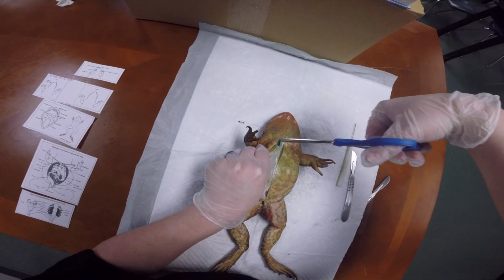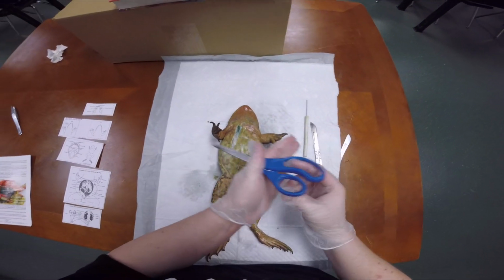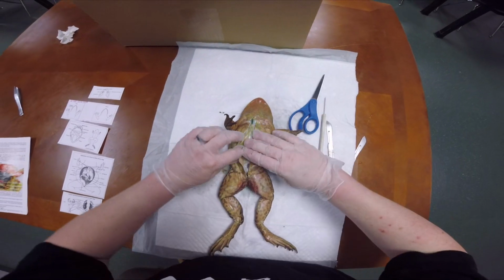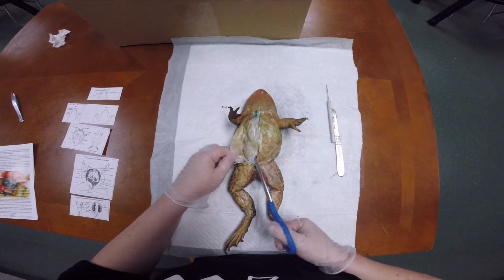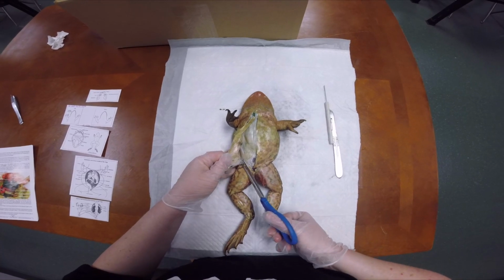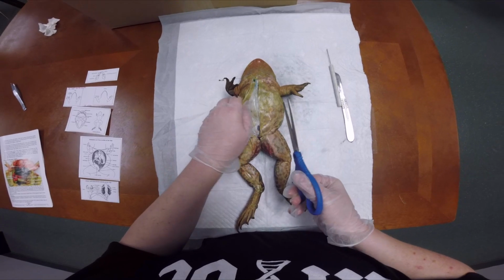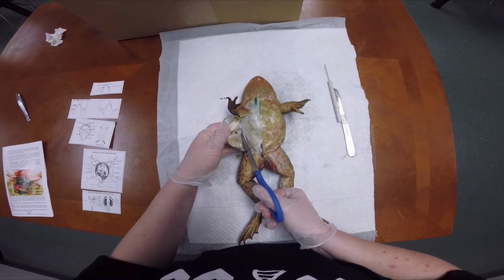So we're going to make him a little vest, him or her, a little vest. Okay, so then you got that muscle wall you got to go through. So I'm going to have to do some extra trimming. Trim, trim, trim.